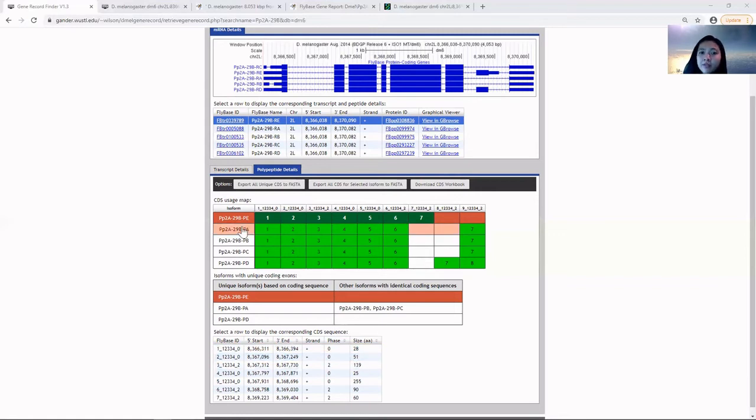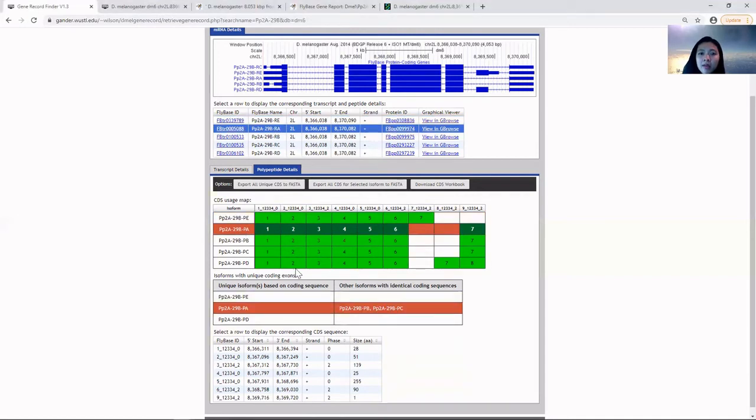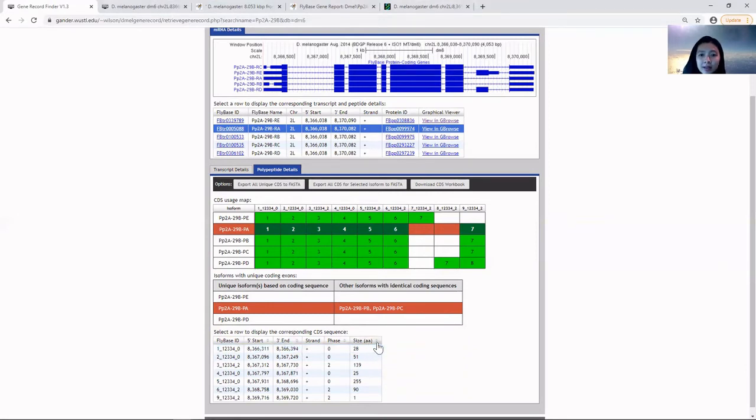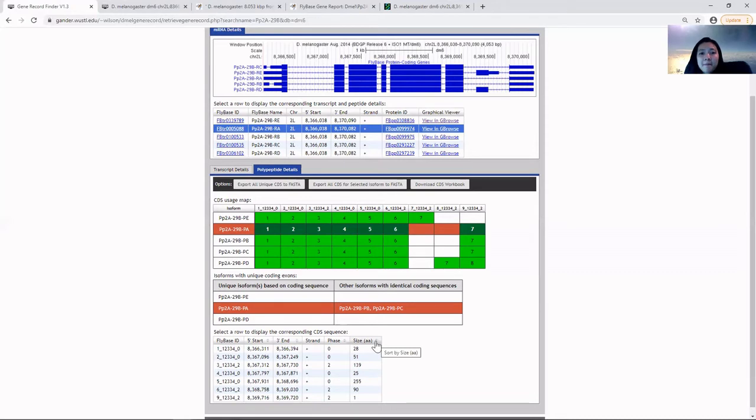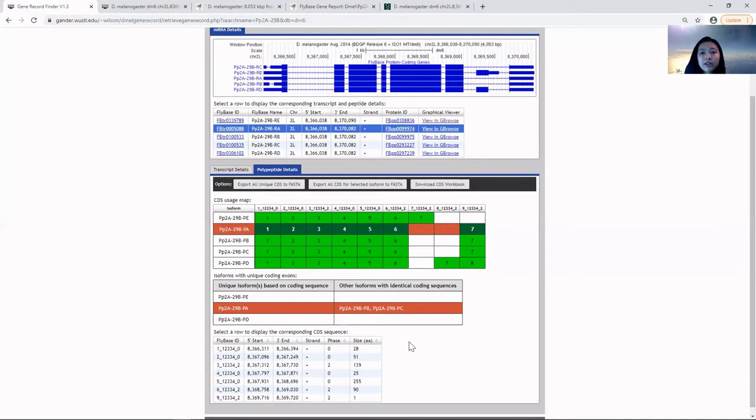If we select a different isoform, for example isoform A, then the CDS table would display the corresponding CDS sequence of isoform A. All this information on this page and table with exon information only deals with the coordinates in Drosophila melanogaster.